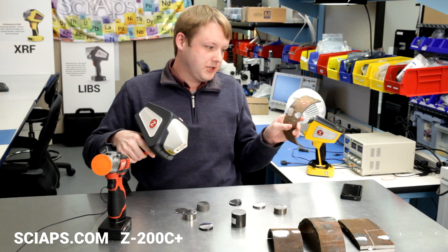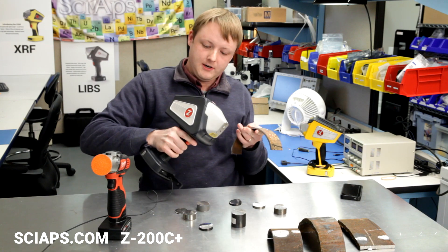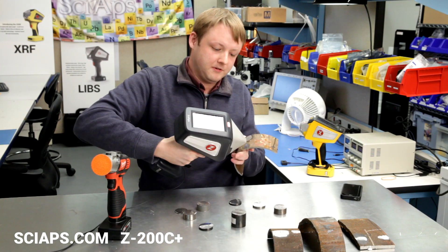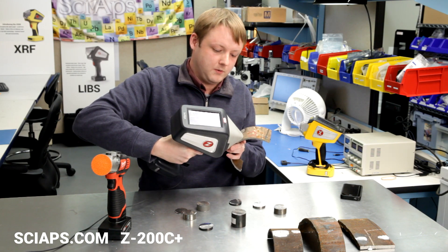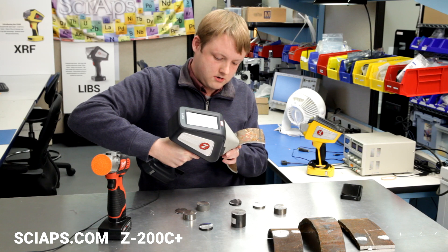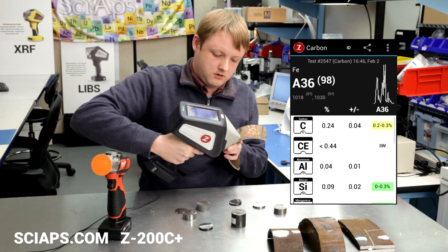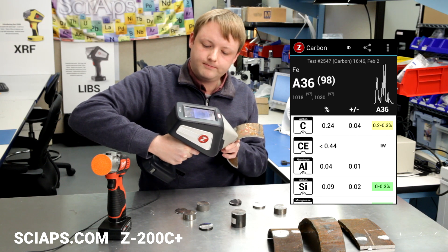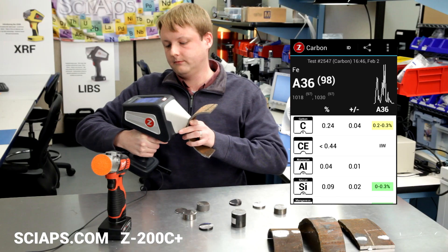Depending on how much scale layer or oxide, you may only need a few seconds of grinding. The analyzer has a camera on it that's really helpful for positioning — to make sure you hit exactly where you ground the sample. There's your A36. We're also showing carbon equivalence in this software, which is also unique. Nobody does that with a handheld either.